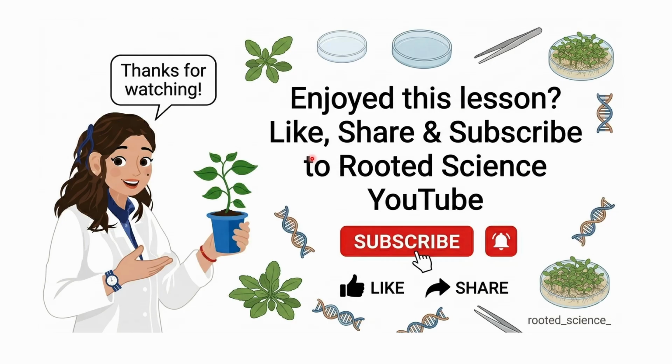And that brings us to the end of our guide. Growing Arabidopsis is as much an art as it is a science, but with these protocols in your toolkit, you are ready to produce high quality reproducible plants for your research.